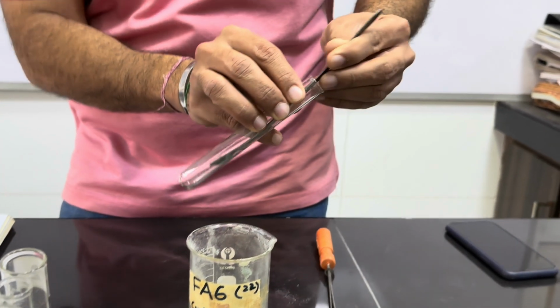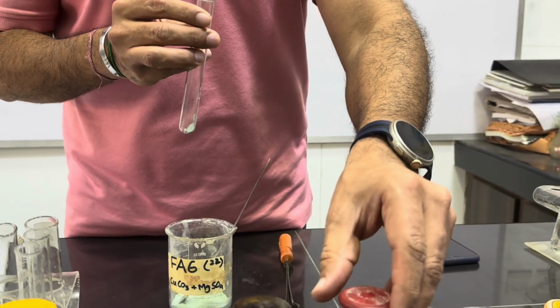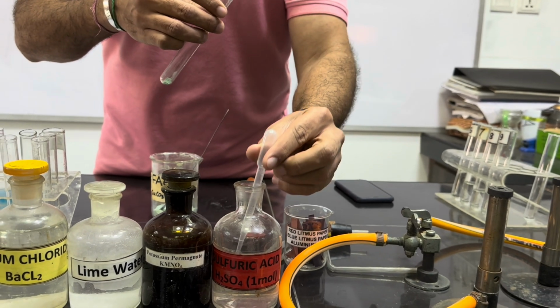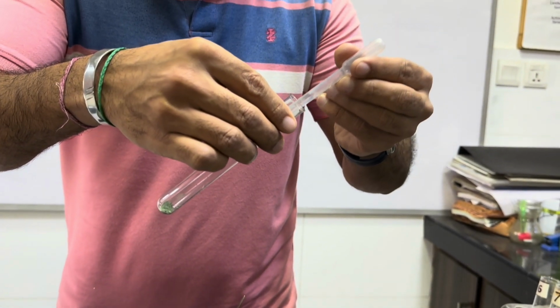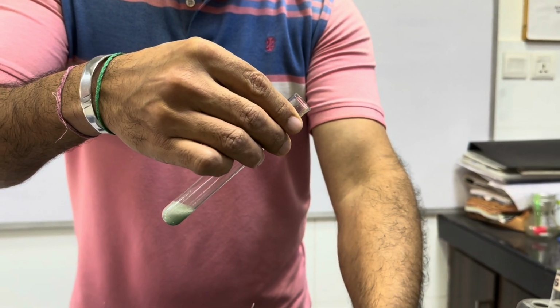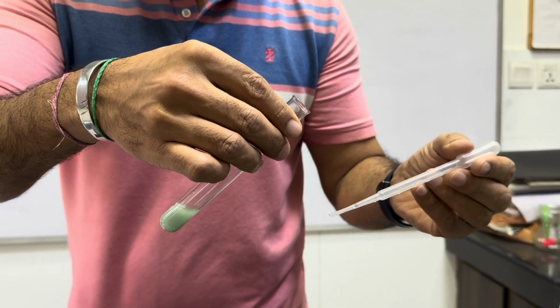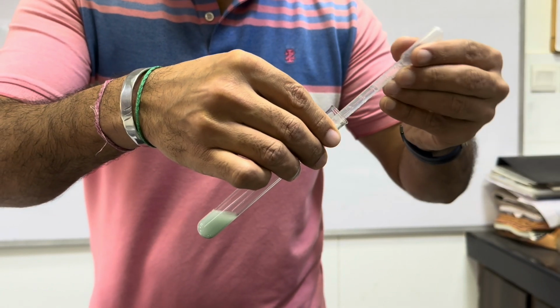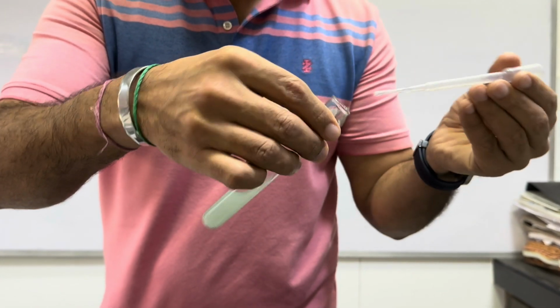So we will take this small spatula measure in this test tube and we will add sulfuric acid first until the reaction is complete. So here is the sulfuric acid and this is the dropping pipette we will use, and we will observe the changes happening in the content of this test tube. As soon as we add sulfuric acid, we can see fizzing started. Add more sulfuric acid and the solution is showing a lot of fizzing. Until the reaction is complete, we have to add sulfuric acid. So this is sulfuric acid added.